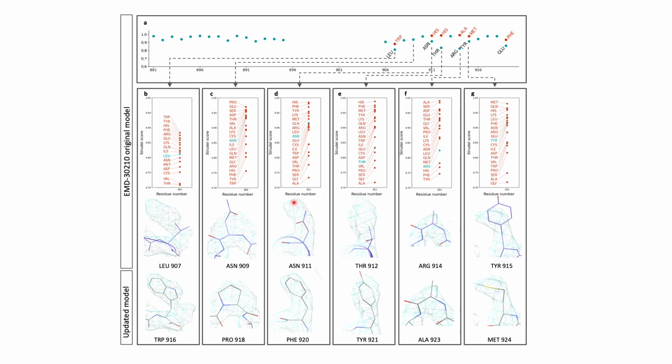An asparagine has been modeled here, whereas Strudel says, well, it looks more like a histidine, a phenylalanine, or a tyrosine, and it turns out to be a phenylalanine in the correct model. So this is a very nice way to potentially detect register errors and to fix them in Chimera. So the plugin works well with Isolde, so you can go ahead and start rebuilding your model straight away.